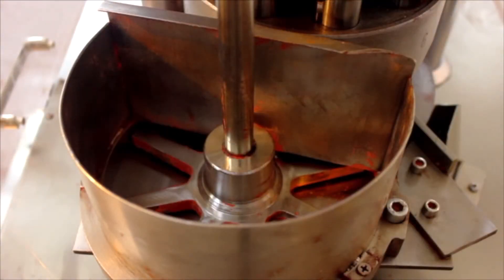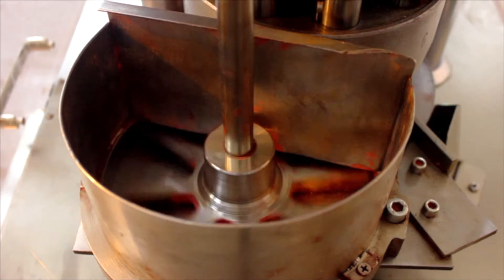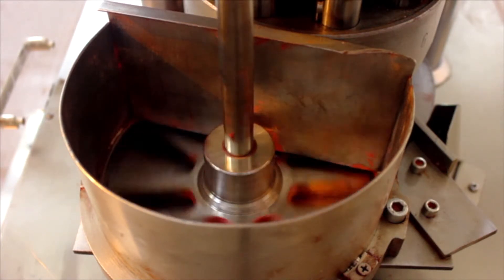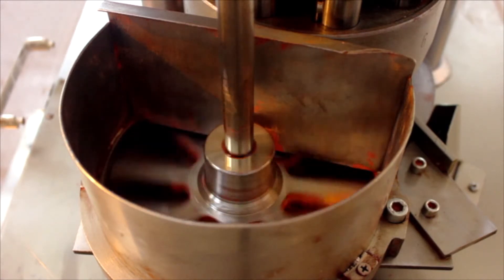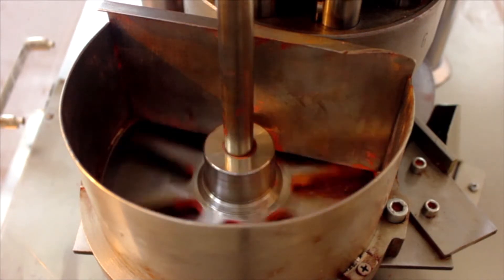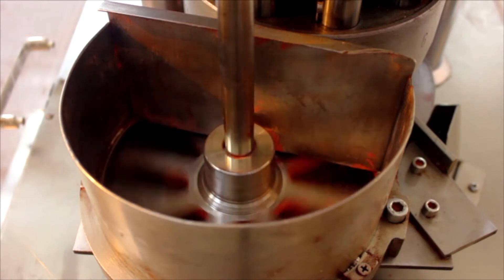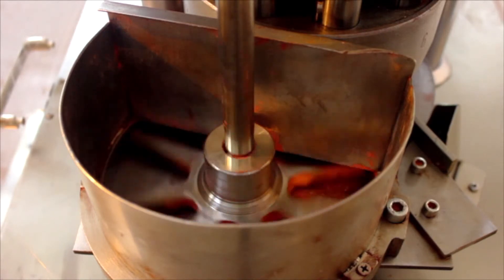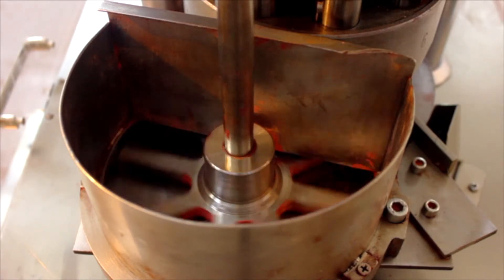Here you can see a close up shot of the inside of the force feeding system. The rotary paddles cause the powders to move consistently into the dies rotating underneath. As you can see, the speed is adjustable so products that are having greater difficulty flowing can be given more speed.